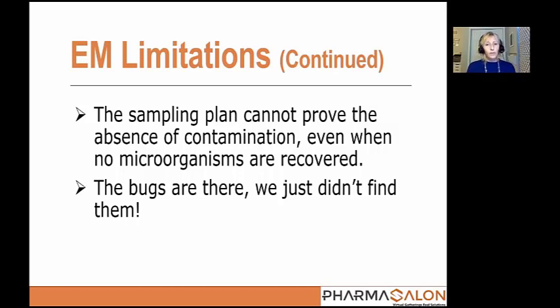So other limitations here. The sampling plan itself cannot prove the absence of contamination, even when no microorganisms are recovered. So just because you get zeros on your plates doesn't mean that the bugs were not there. It's just that we didn't happen to find them during that sampling session. Again, just a limitation of what we're dealing with here. We're really using 200-year-old science at this point dealing with microorganisms. And look, dealing with living things, it's difficult. It's not any different than dealing with toddlers. You can't control what they're doing all the time.